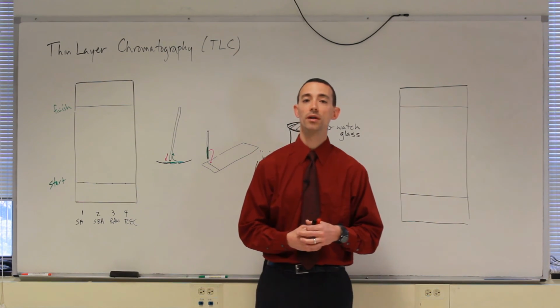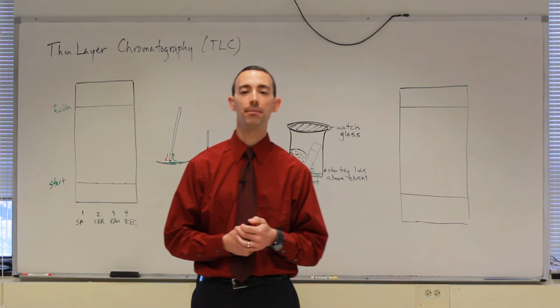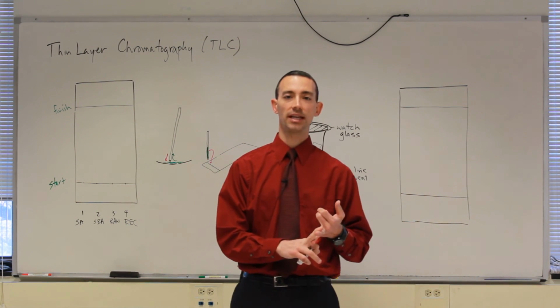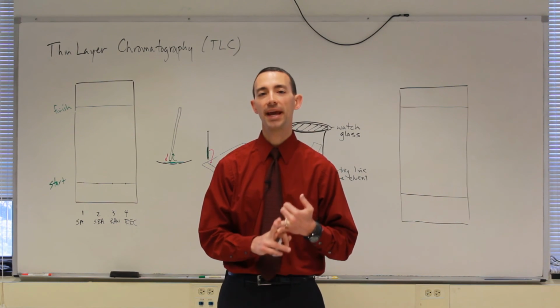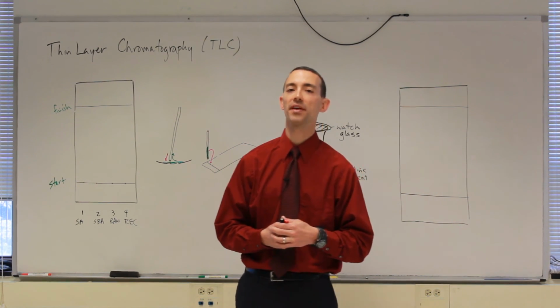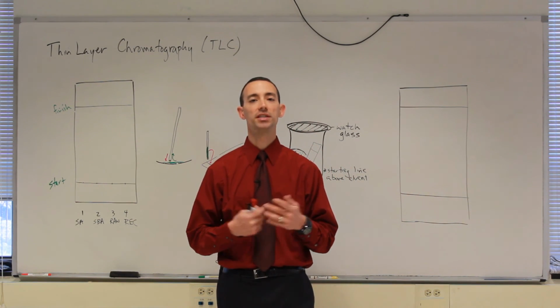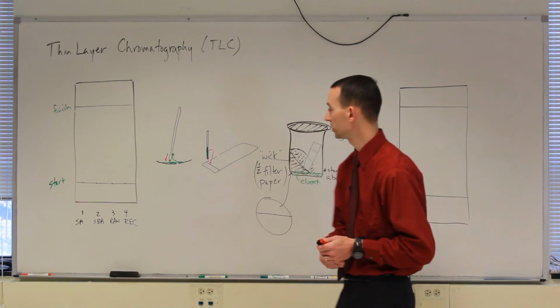Long story short, our two different compounds that we're really interested in this lab, aspirin and salicylic acid, have different polarities, and they should behave slightly differently then. And thin layer chromatography is the test that should distinguish them from one another based on the polarity differences.